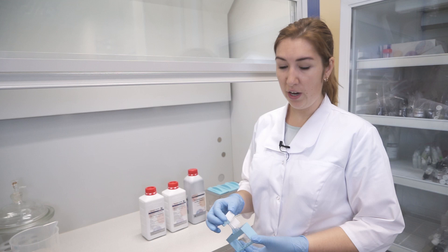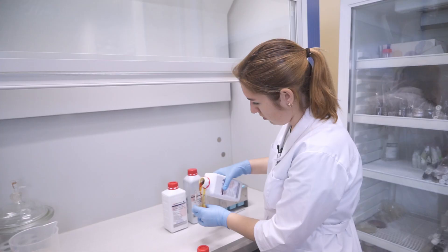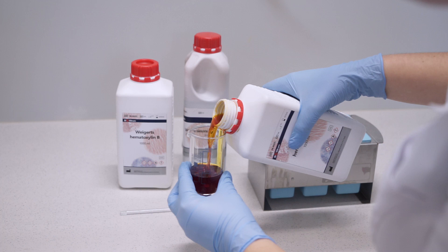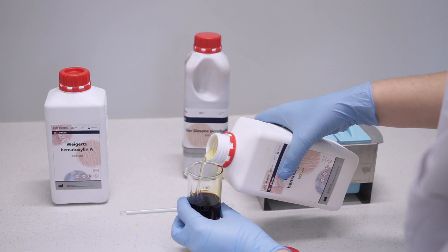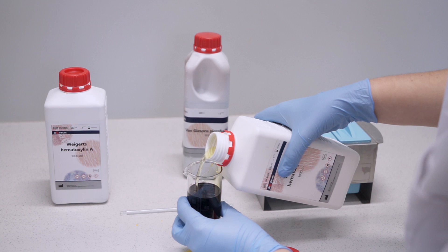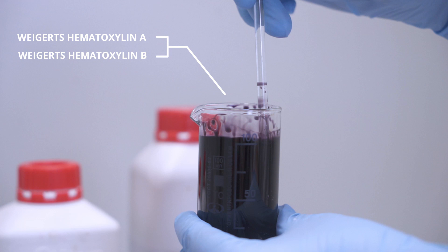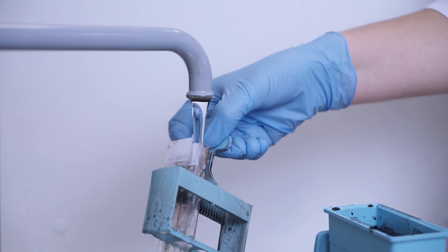Deparaffinized and rehydrated slides with samples are first put in distilled water. Then we use Weigert's hematoxylin, prepared right before staining as a mixture of solutions A and B. We put the slides in this mixture for 10 minutes, then place the slides under running water for 10 minutes.